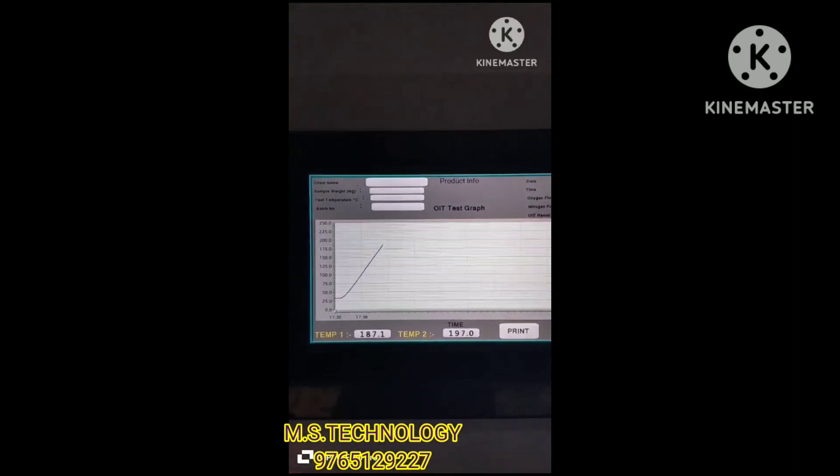On the top side, there are sections to enter party details. First, there is a client name — click on the window in front of client name and enter the name of the client. Then there is a section for sample weight — enter the weight. Set the first temperature, which is 200 degrees Celsius. You can also enter the batch number if there is any. Here is how the graph of the OIT can be made, and you can print this graph.